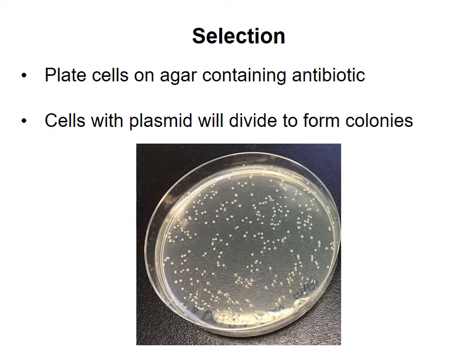After transformation, you incubate the cells on an agar plate containing antibiotic that corresponds to the selectable marker on the plasmid. Cells that contain the plasmid will be resistant to antibiotic and will grow on your plate to form colonies. However, that's no guarantee that the plasmid contains the insert you want — for example, maybe the ends of the cut plasmid were ligated back together without the insert. Therefore, we must test some of these colonies to find one that contains the recombinant plasmid that we tried to create.